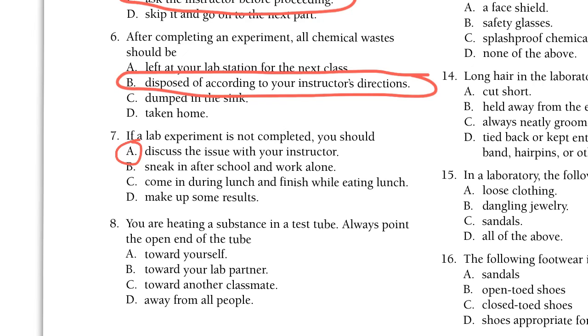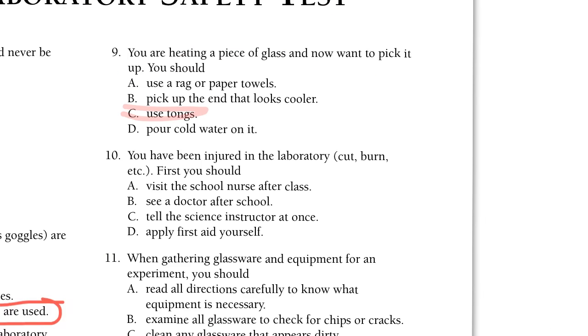8, you are heating a substance in a test tube. Always point the open end of the tube toward yourself, toward your lab partner, toward another classmate, or away from all people. Wait, there's an answer choice.